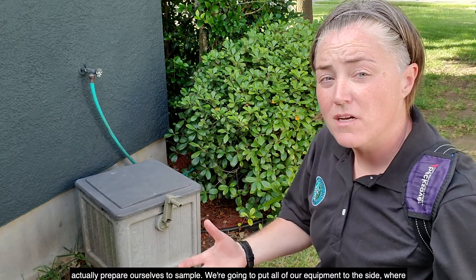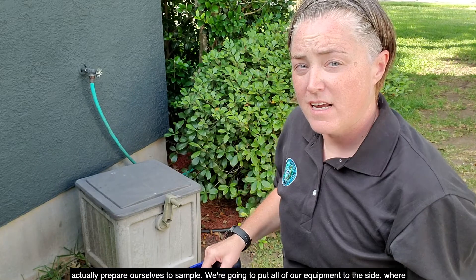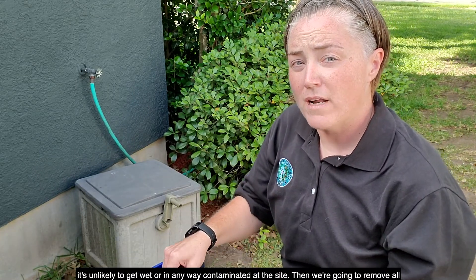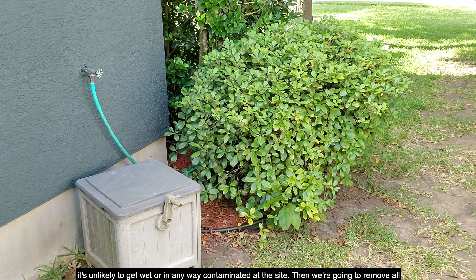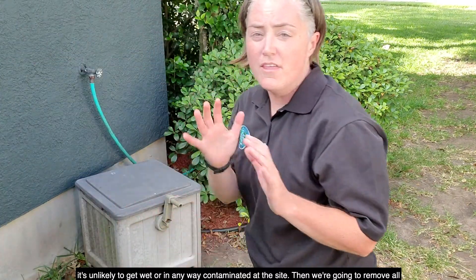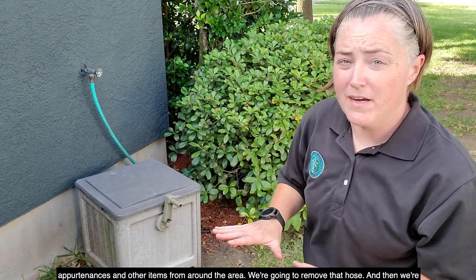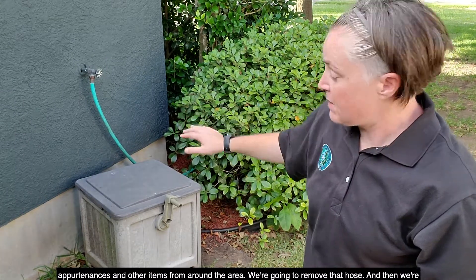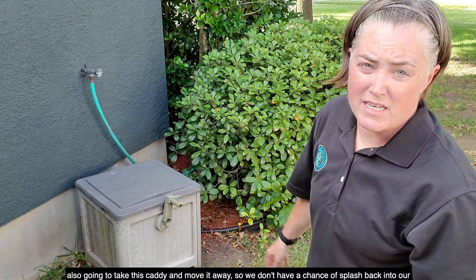So now we're going to actually prepare ourselves to sample. We're going to put all of our equipment to the side where it's unlikely to get wet or contaminated at the site. Then we're going to remove all appurtenances and other items from around the area — we're going to remove that hose and move the caddy away so we don't have a chance of splash back into our sample.